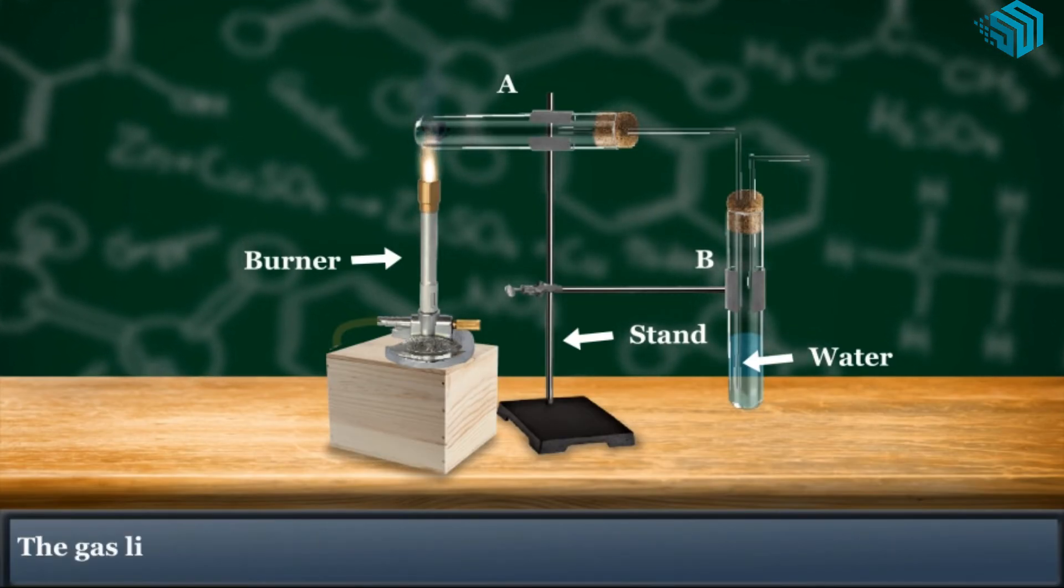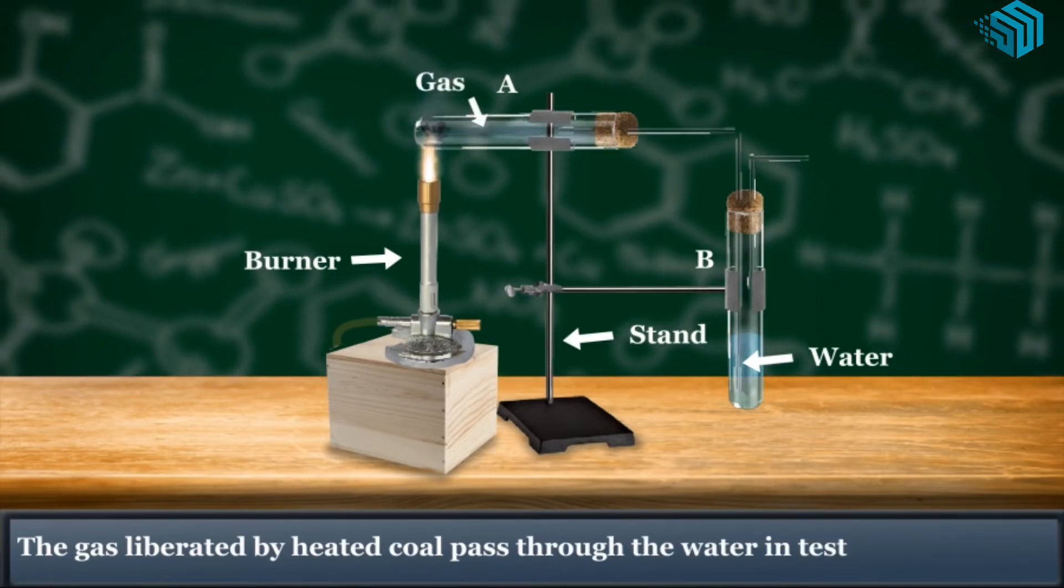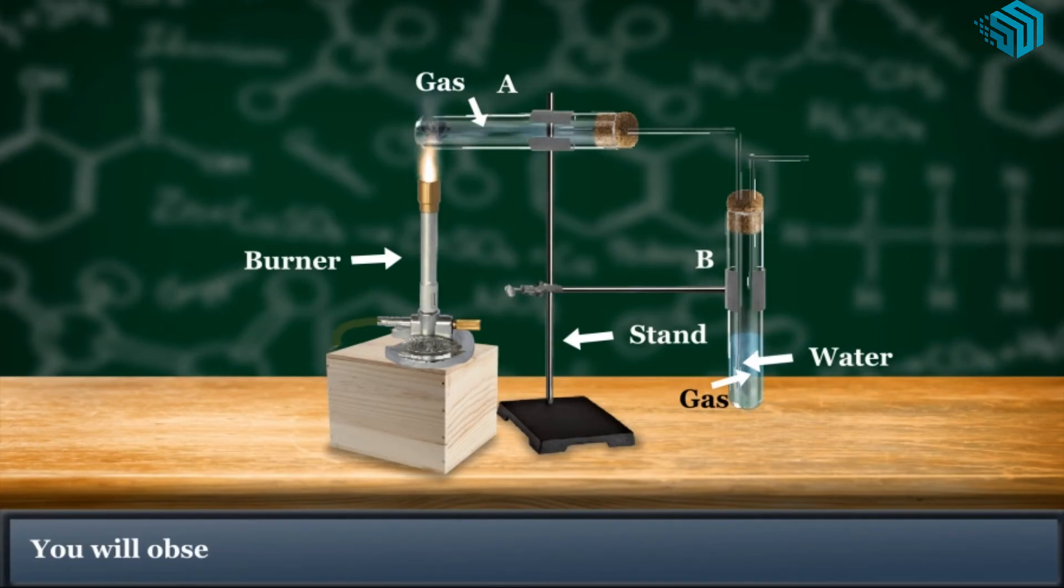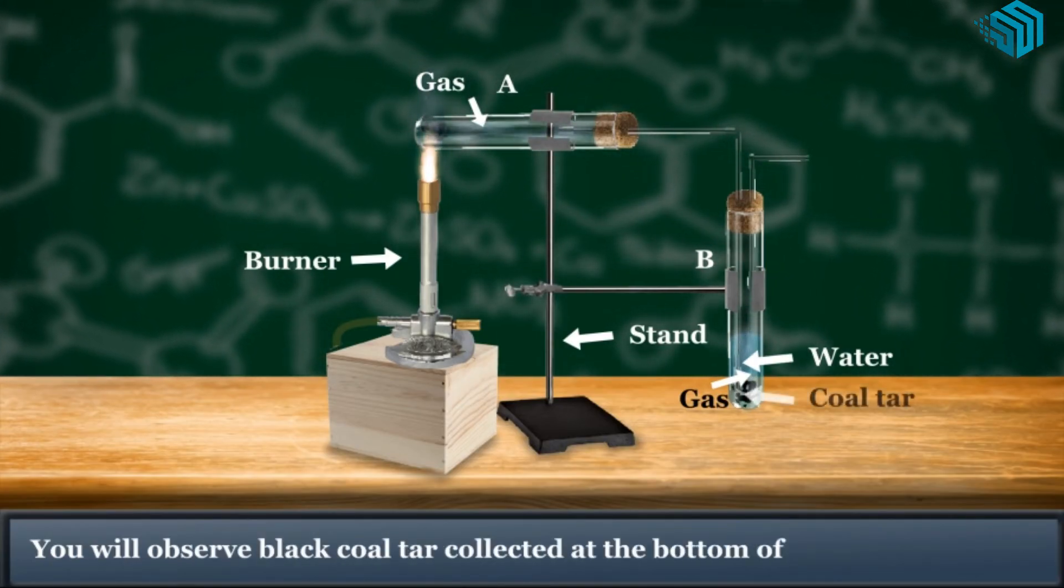The gas liberated by heated coal passed through the water in test tube B. You will observe black coal tar collected at the bottom of test tube B.